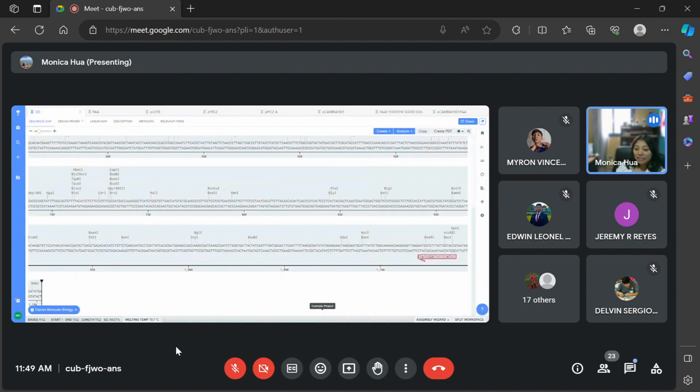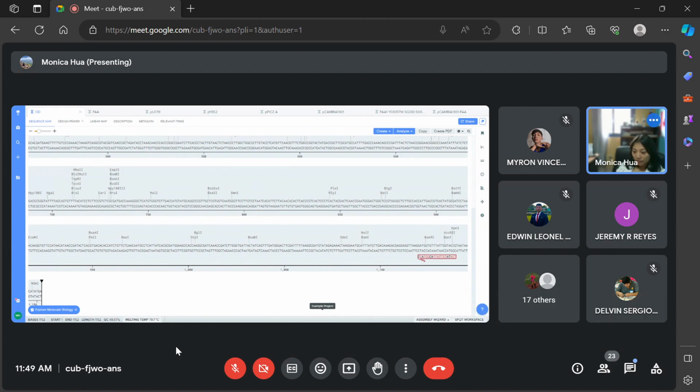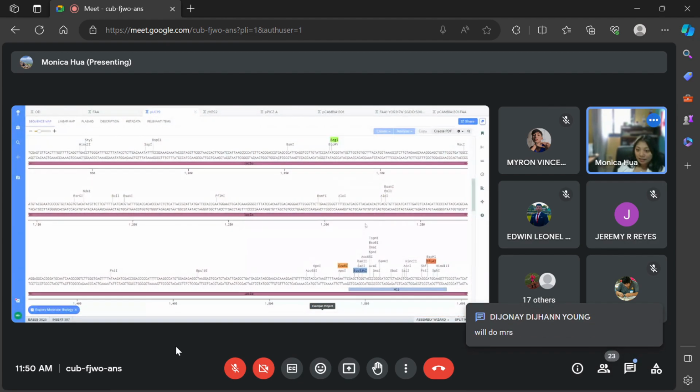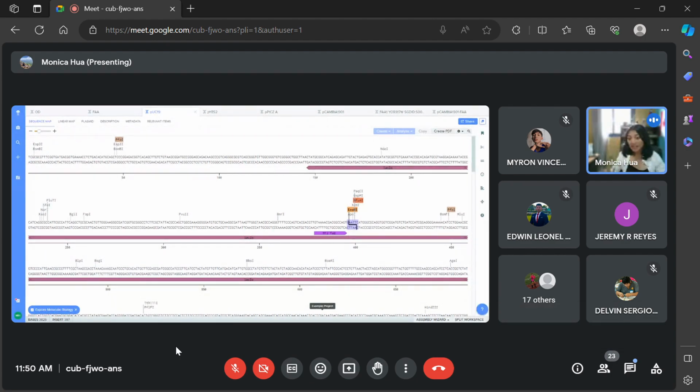All right, we're finished? Okay, well, just make sure you remember this part then. After that, I want you to visualize your sequence, and maybe categorize it.